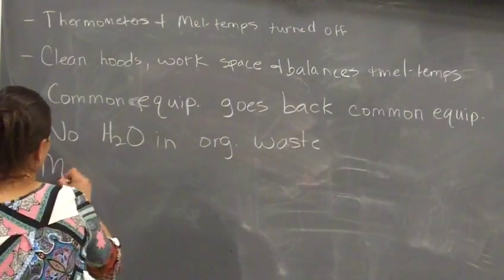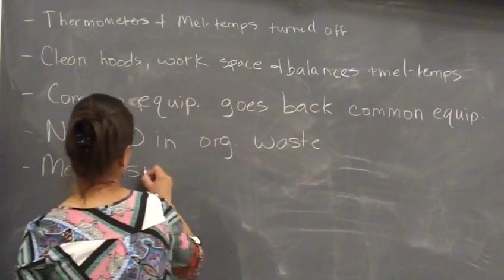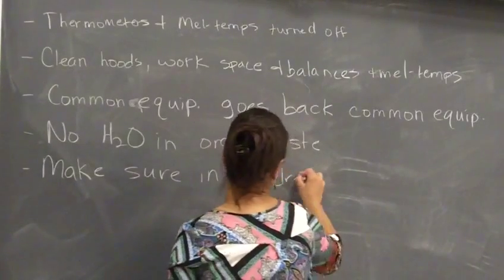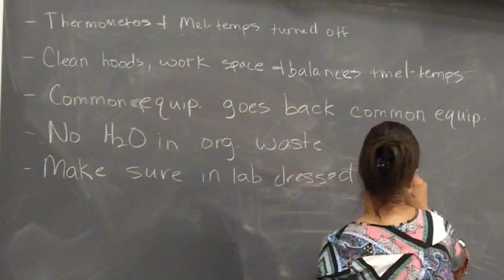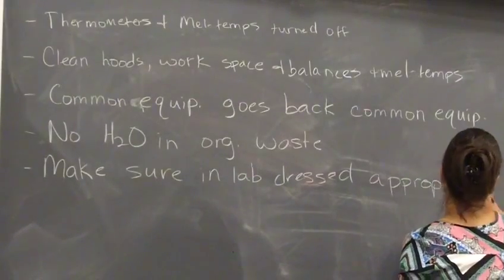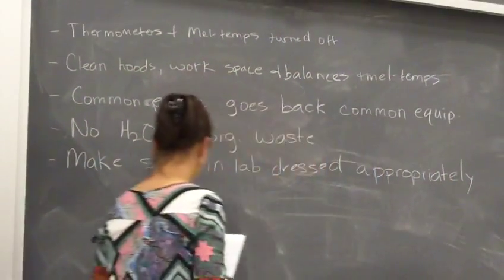Make sure you come to lab dressed appropriately. And open lab. If you're in the lab, you need to be dressed appropriately, okay? So appropriate shoes, appropriate pants and so forth. Make sure you have your safety glasses on at all times.